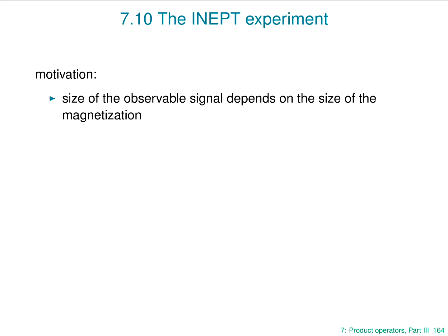This was one of the very first multiple pulse experiments, and it's become an absolutely crucial building block, particularly in heteronuclear experiments, all the sorts of experiments you might use, for example, to do protein NMR. They're all based on the ideas which arose from this INEPT experiment. So again, it's really worthwhile spending some time looking at it.